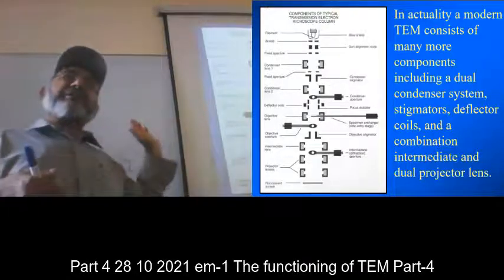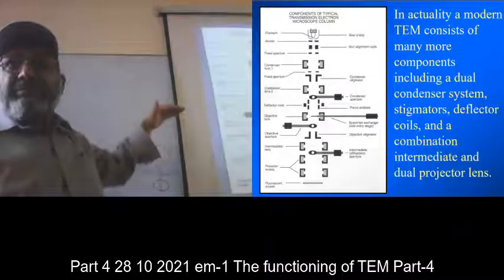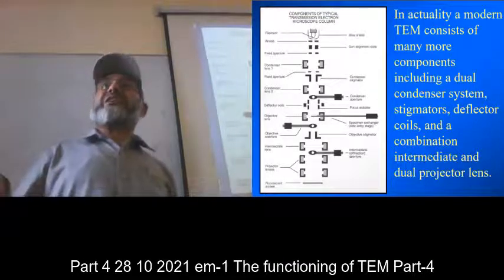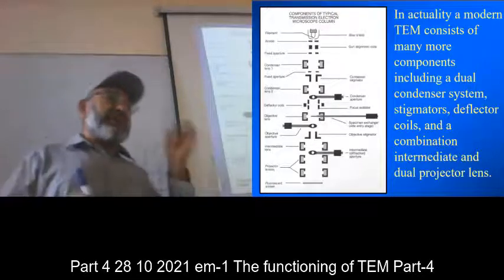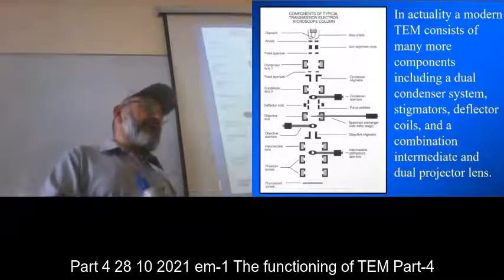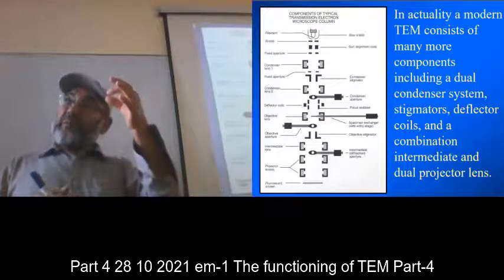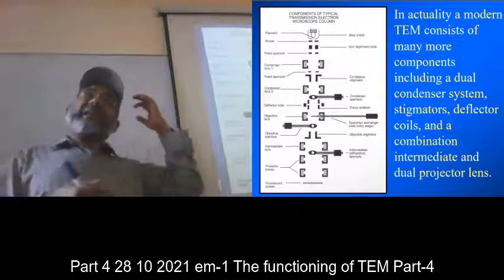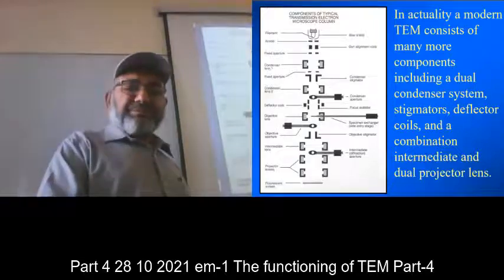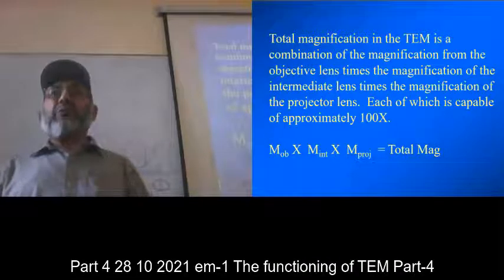Secondly, when you are interested in composition analysis, the electron beam is coming across the sample, and the contribution from the whole sample is coming, and you are not interested in the whole sample. You are interested in the composition or diffraction pattern of a single crystal. That is why you are using the transmission electron microscope. Then for that purpose, you fix the aperture in such a way that in the image as well as in the diffraction pattern, the rays which are required are projected.